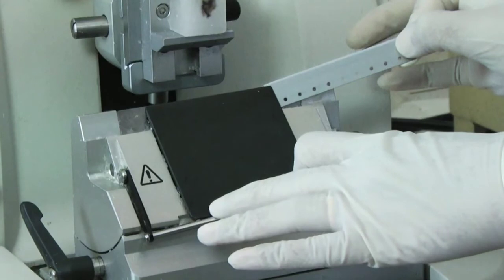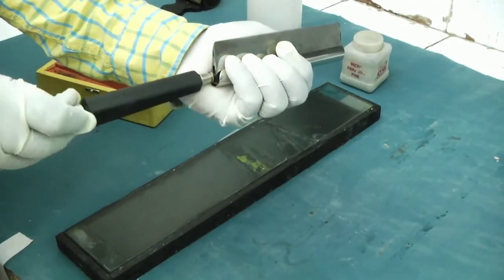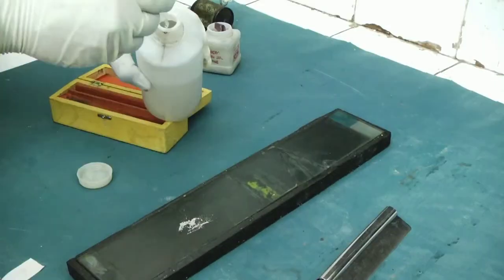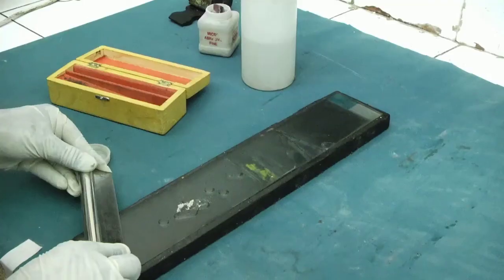If you are using non-disposable knives, sharpen the knife by the following techniques. Honing: microtome knives are sharpened against a special stone called a hone. Honing refers to grinding the cutting edge of the knife on a hard abrasive surface to sharpen the knife.